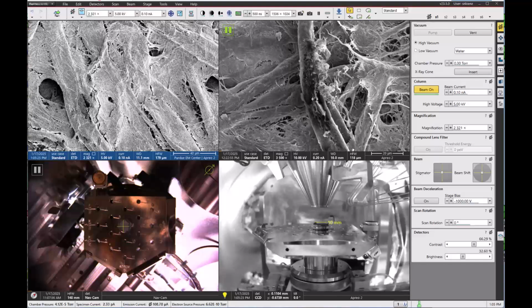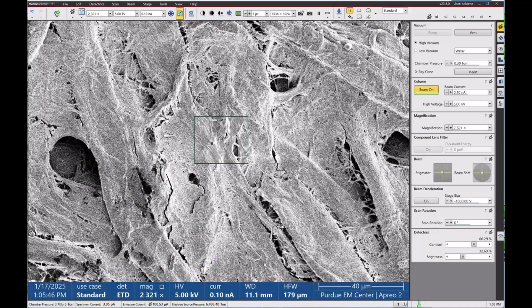All right. And when you're using the SEM, you do have the option to use a reduced area tool to do fine surface detail focusing so you get a better resolution in your image, because I'm updating fewer pixels here, so I can use higher pixel dwell time and higher scanning resolution. You can also hit F5, function key 5 on your keyboard so that you can see a little bit better. And there, my image is in focus.